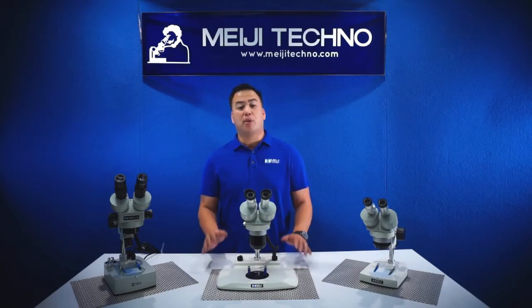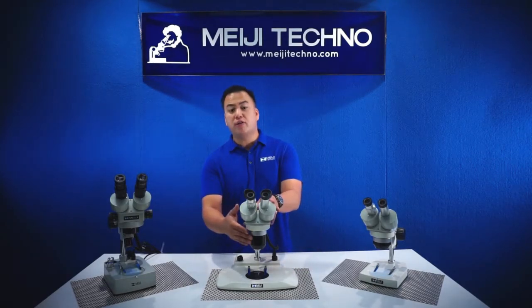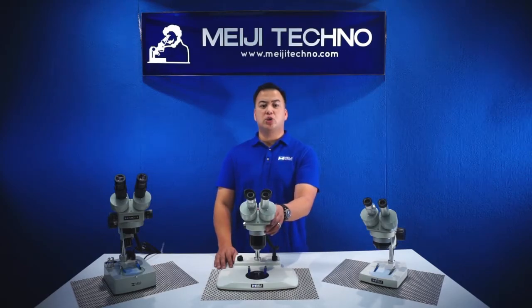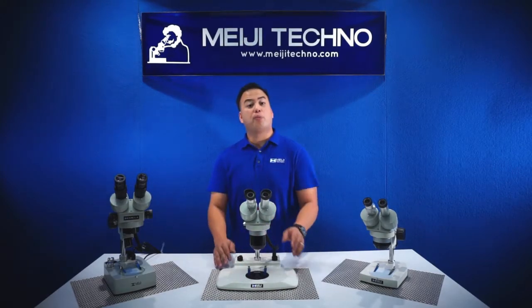This system is very popular amongst gemologists and dental laboratories. Both models give the user the ability to freely switch between two different magnifications by simply rotating the rotatable turret. The EMT1 and the EMT2 give the users 108 millimeters working distance, or 4.2 inches.